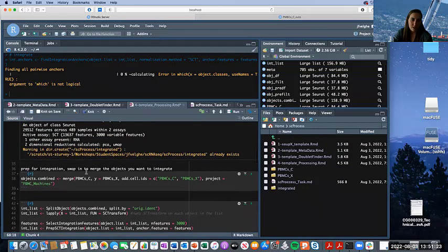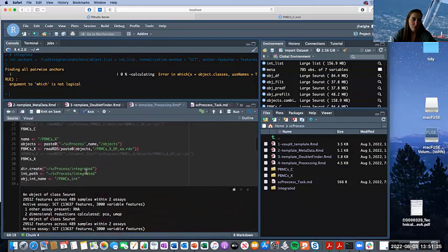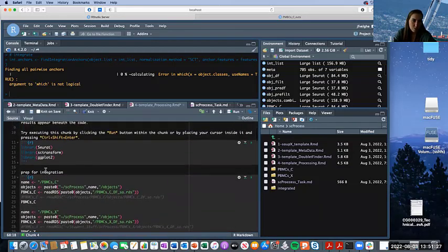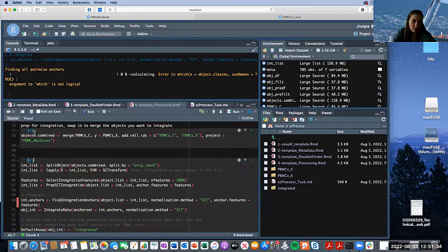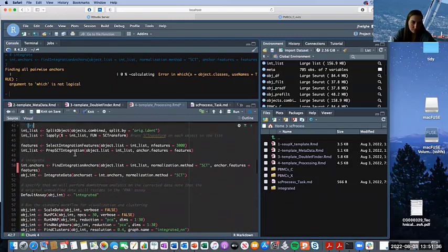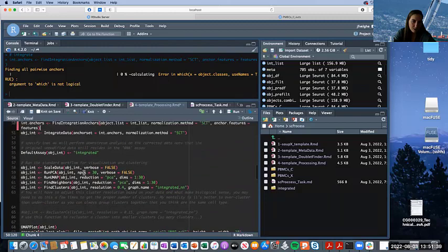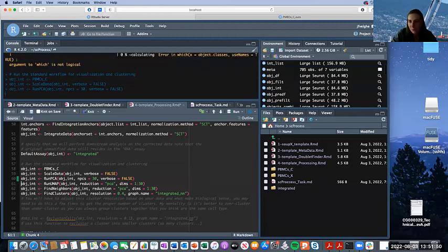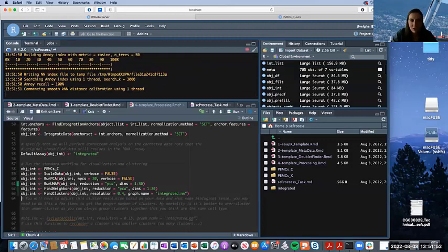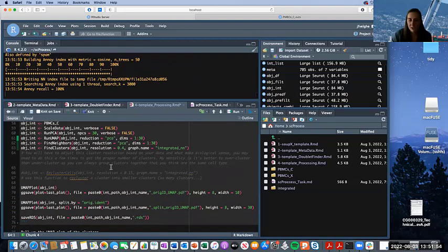So what I'm going to do is run this without merging the objects together, so let's see if maybe that's an issue. I guess I can't really integrate it, but what I'll do is, don't do what I'm doing. I'm just going to get so I can show you similar plots and we can keep moving forward with the visualization.